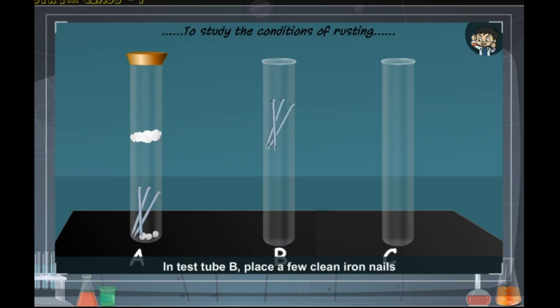Test tube B: In test tube B, place a few clean iron nails and pour boiled water into it. The boiled water does not contain any dissolved gas. Put a layer of oil over the boiled water.